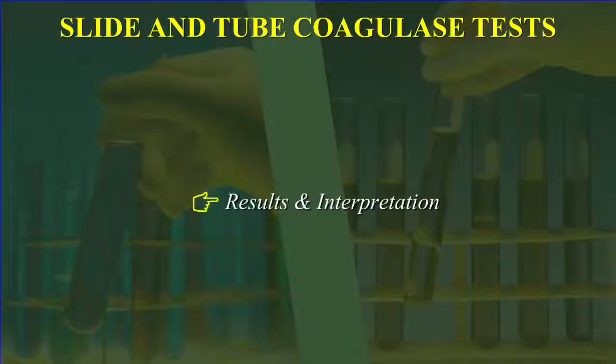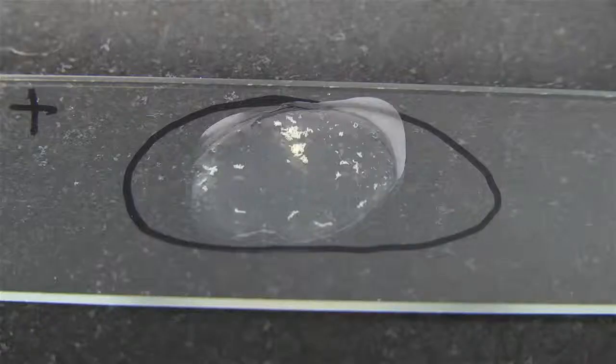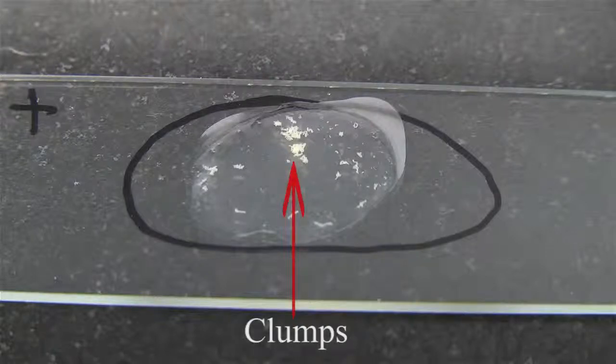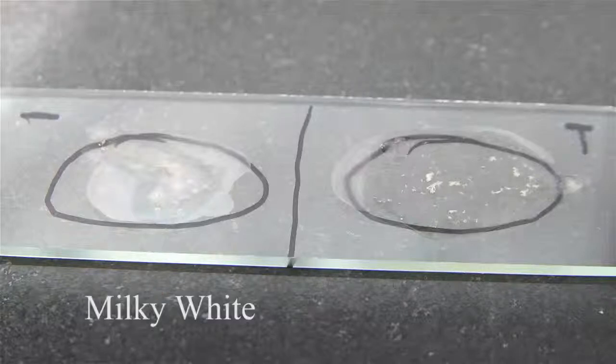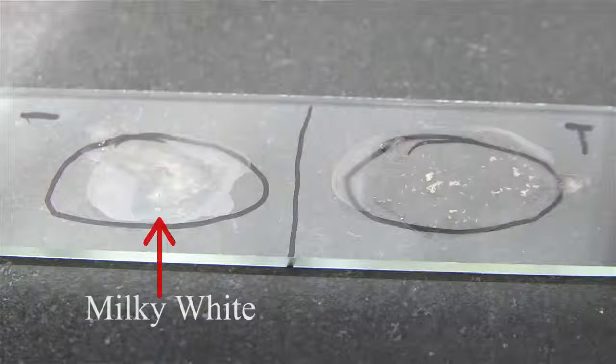Results and interpretation. A positive test is indicated by formation of white precipitate or clumps within 10 to 15 seconds of addition of plasma. The section of the test slide without the plasma should still look smooth and milky. If this section also develops clumps, then the result cannot be interpreted. Such strains should be further tested with the tube coagulase test.